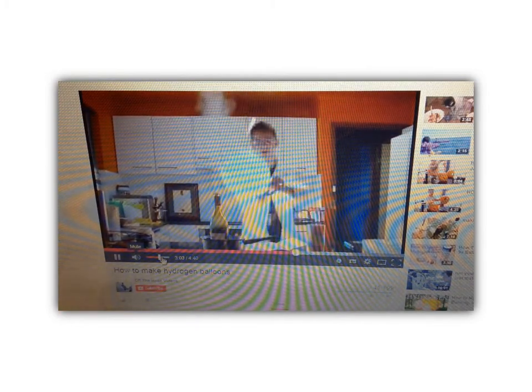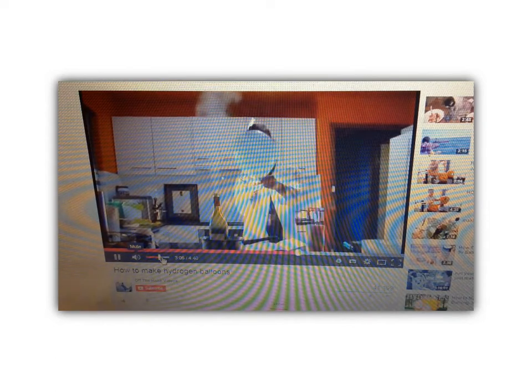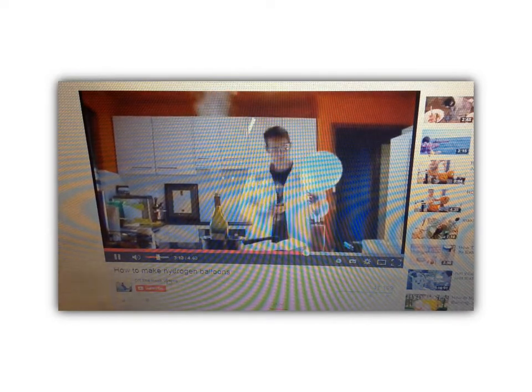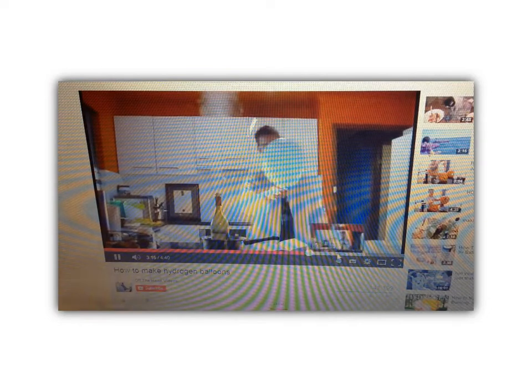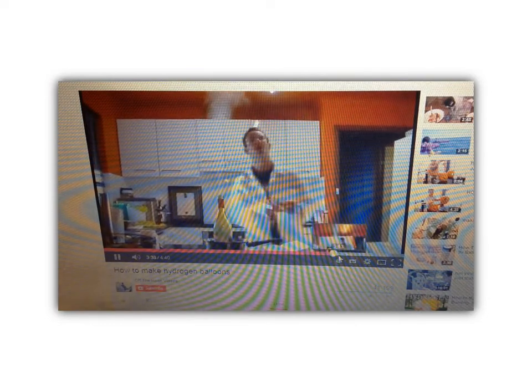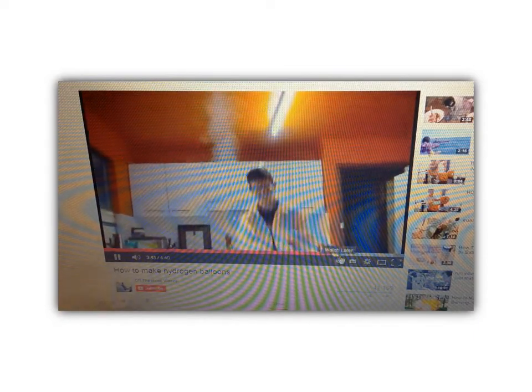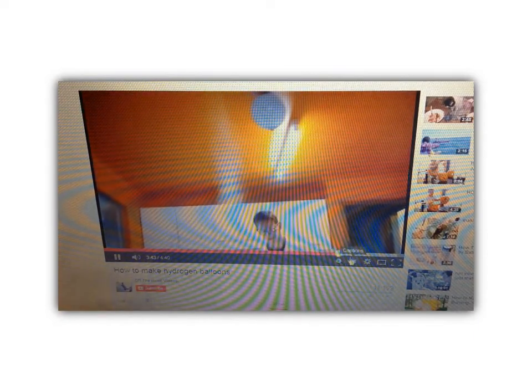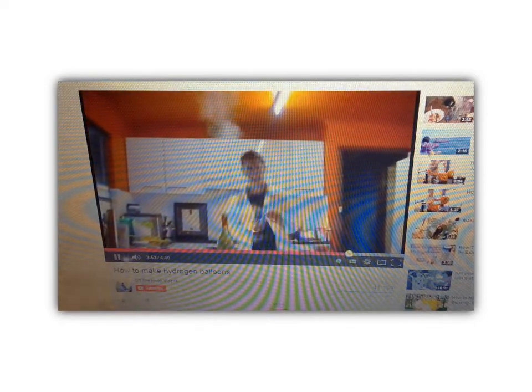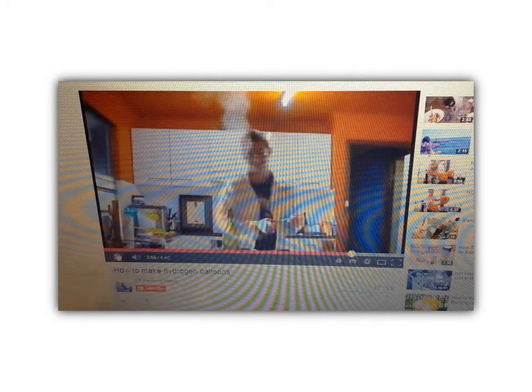Okay, so he's making hydrogen. He's got it in a balloon, and he's going to bring it close to a flame. Oh, there it goes. Definitely full of hydrogen. Hydrogen is less dense than air. Far out. Definitely full of hydrogen gas, guys.